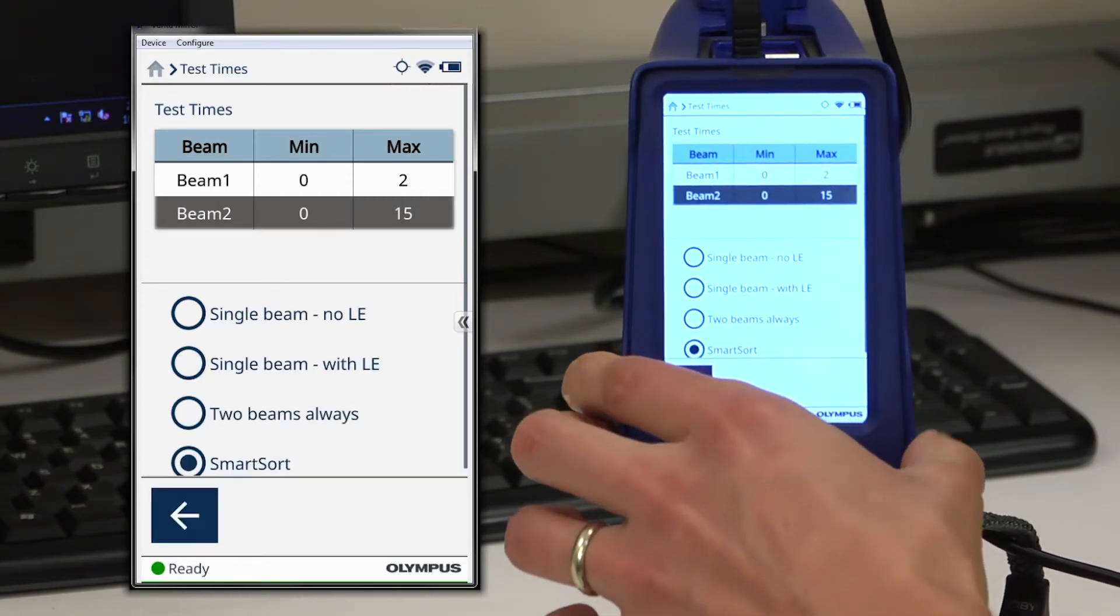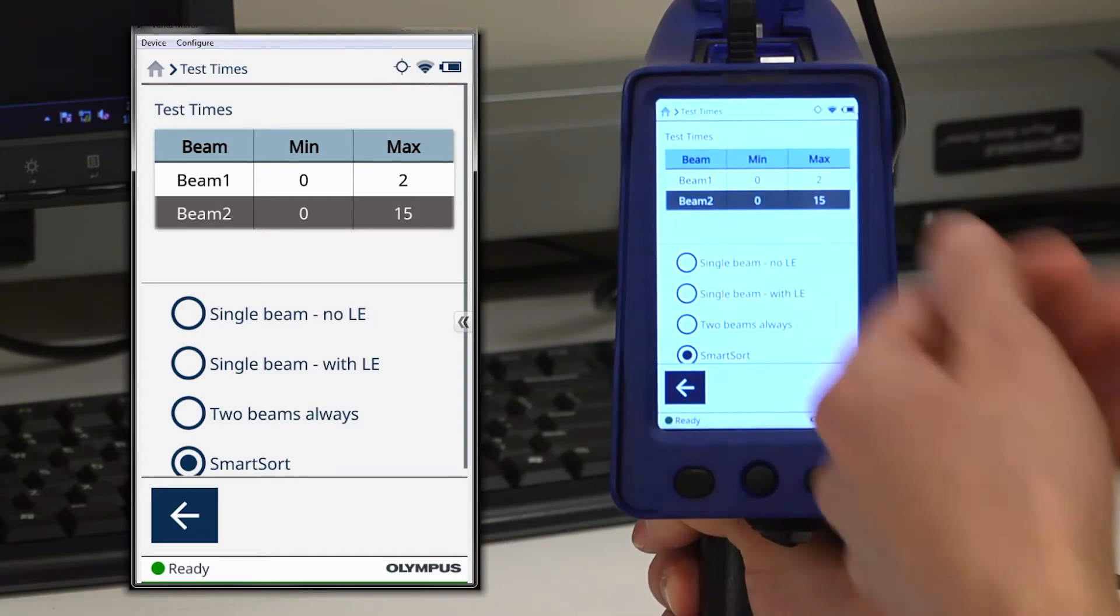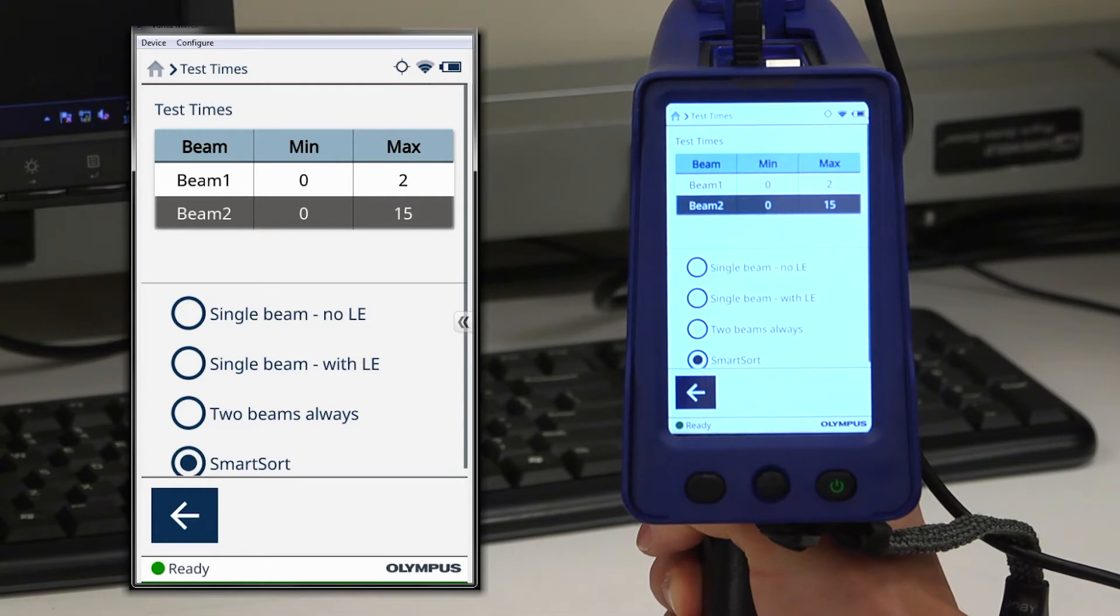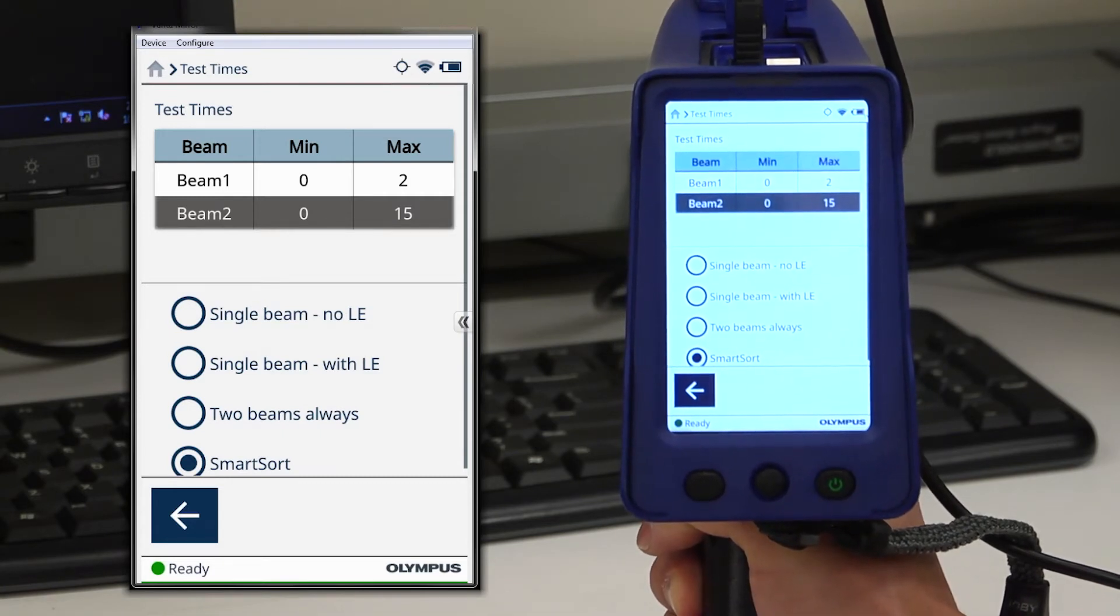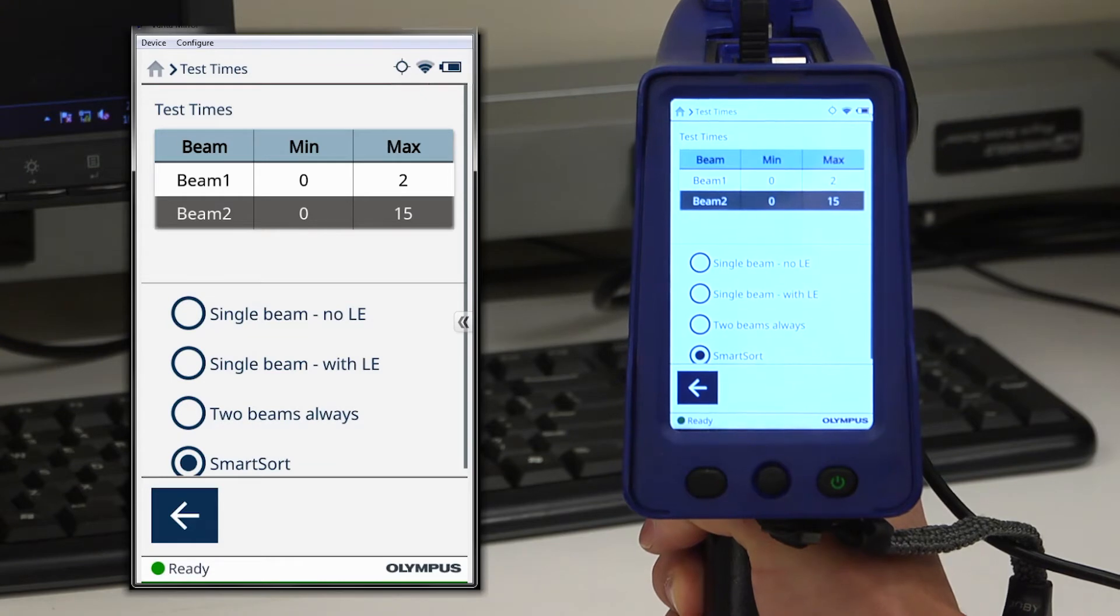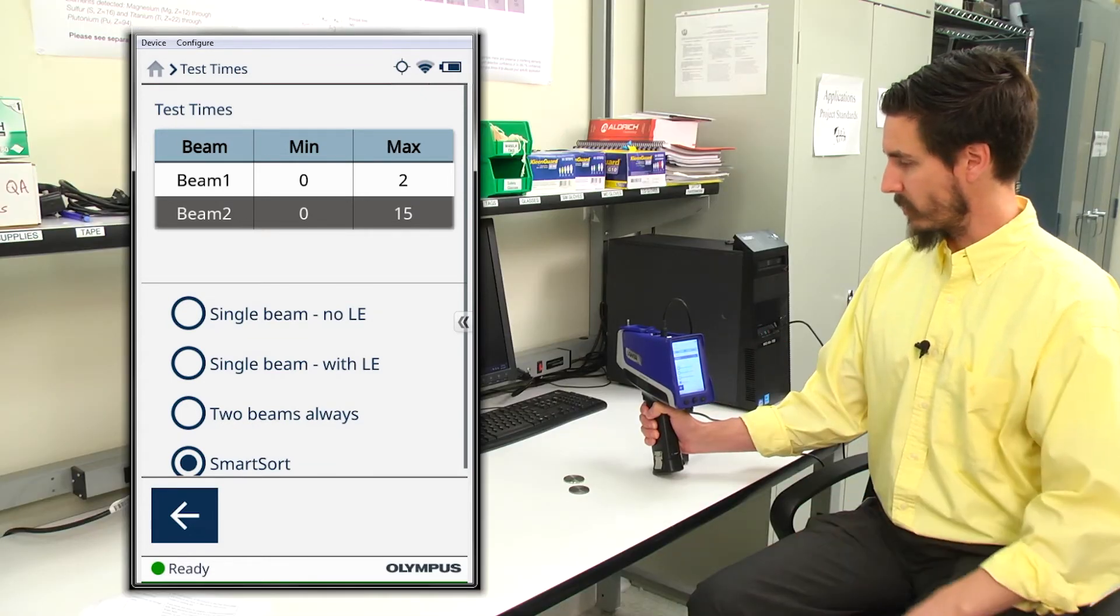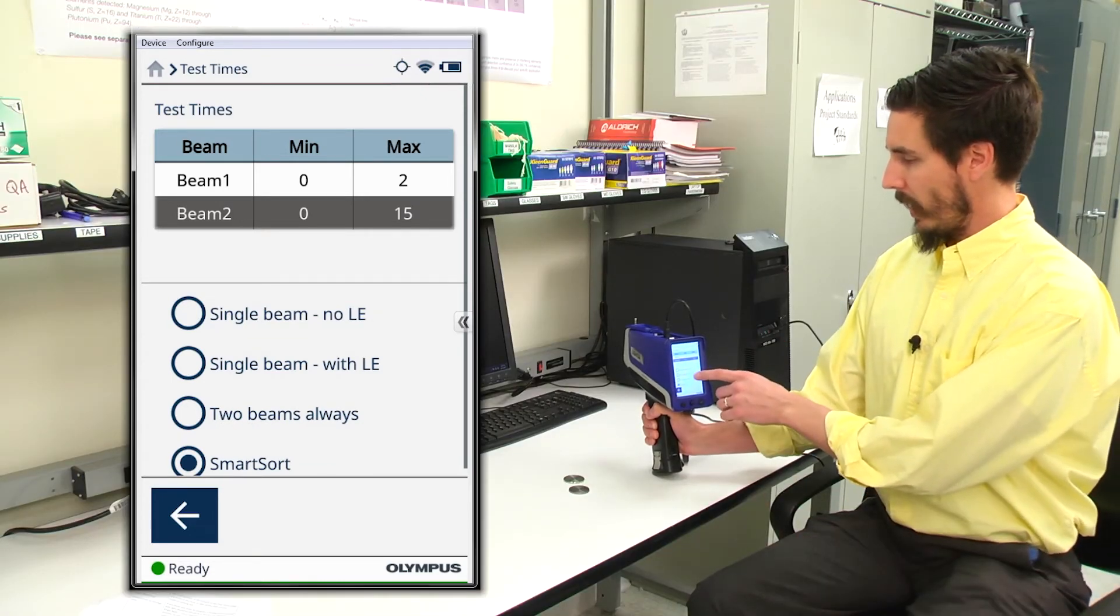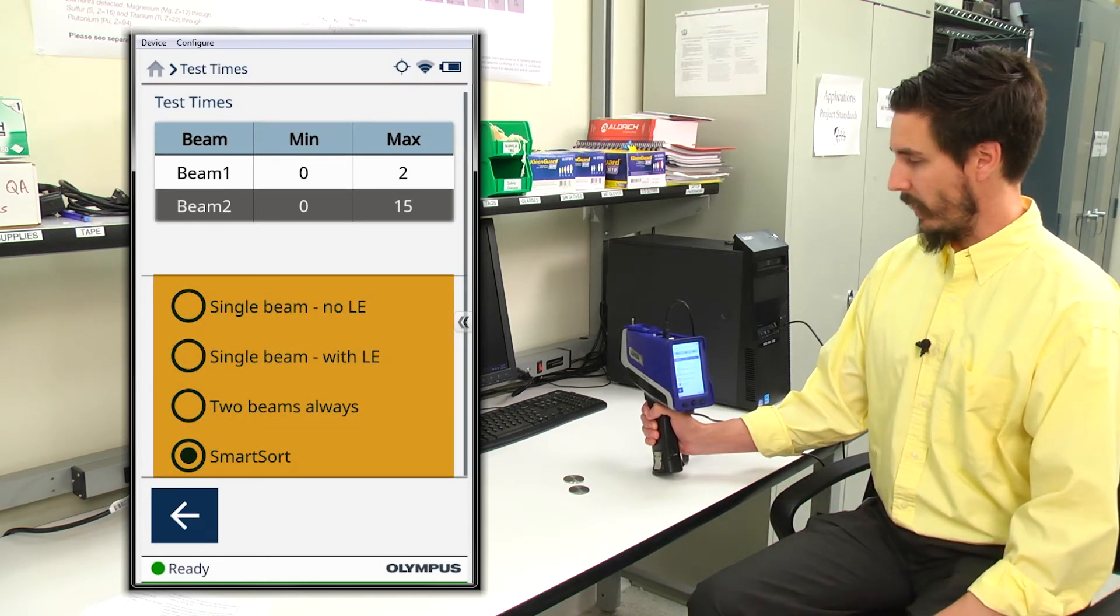Once we have our max test time set, we can also set a min test time, which forces the analyzer to operate for that set amount of time before displaying a result. Once my test time matrix is set, below I have the beam selection radio buttons that I can access here.